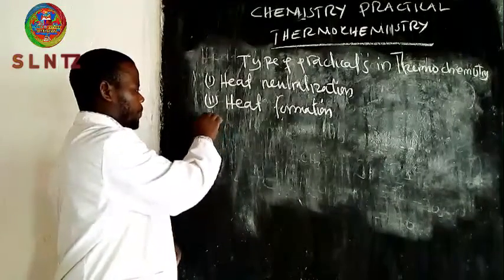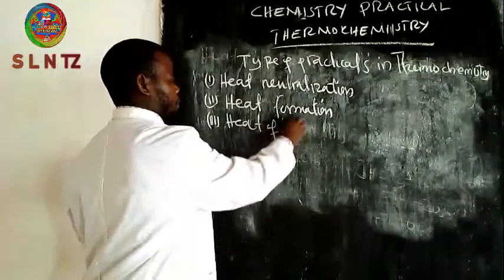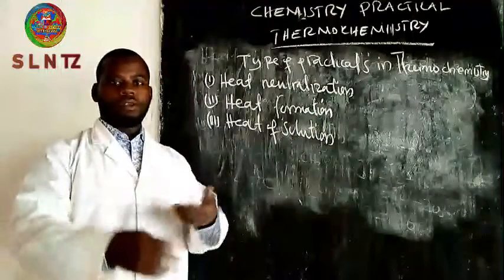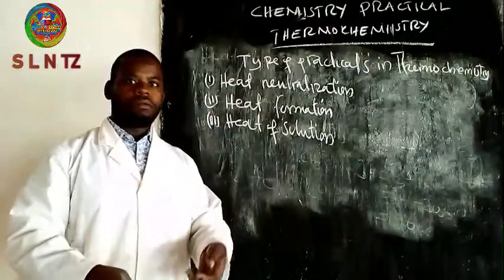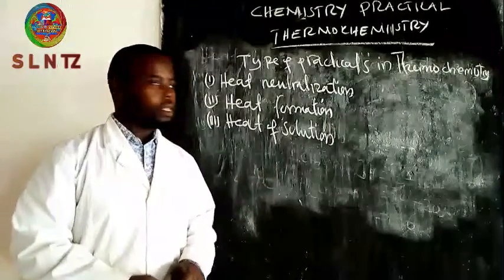Number 3, we are going to study heat of solution, the heat change when you dissolve a substance. That is the concept for our practicals.